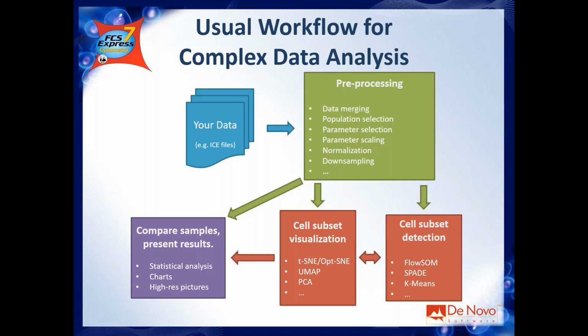The beauty of the pipeline, as we said, is that it is super flexible, because you can combine different steps together and generate a different output. I might want A, B, and C, and maybe one of you wants A, B, C, and D, and maybe another one would like B, A, and D, whatever. So combinability and flexibility are the main points of the pipeline. And if you think about what you're doing in data analysis, it doesn't matter whether you're dealing with flow or images, basically you are doing the same thing. You're always going through a bunch of almost predefined steps.